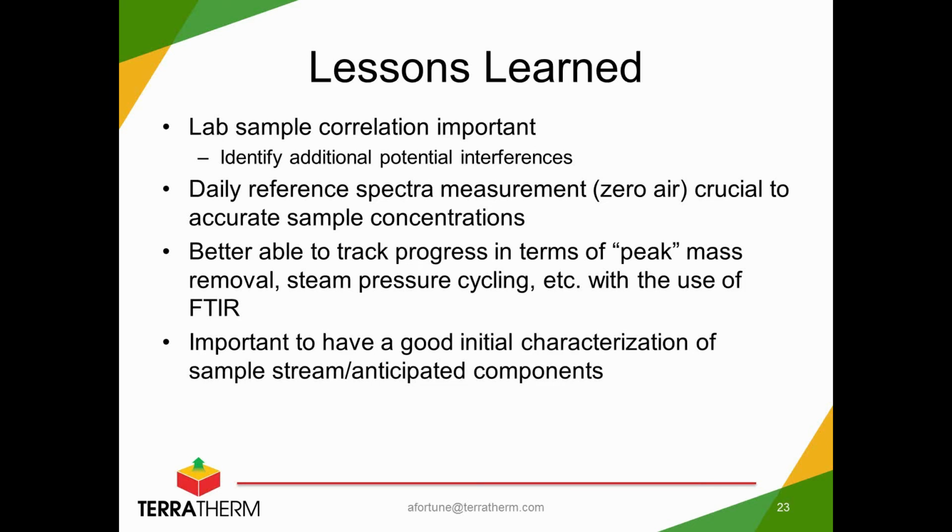I didn't really talk much about it, but there is a daily reference spectra measurement of the zero air, sort of a baseline or zeroing of the instrument. That definitely proved crucial to having accurate sample concentrations. If your reference spectra is not the clean zero air and it happens to be something else by mistake, which happened a couple times to us, it throws off the concentrations because it's comparing your sample spectra to this other reference spectra, and it throws off your quantitation wildly.